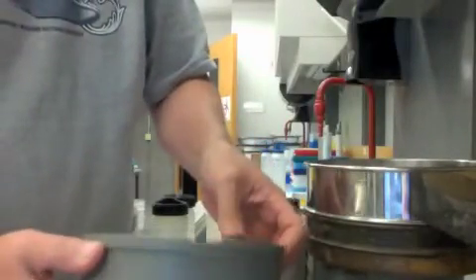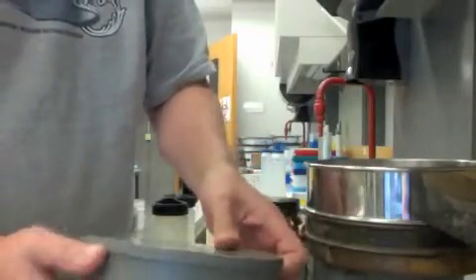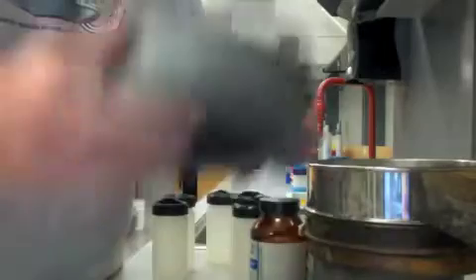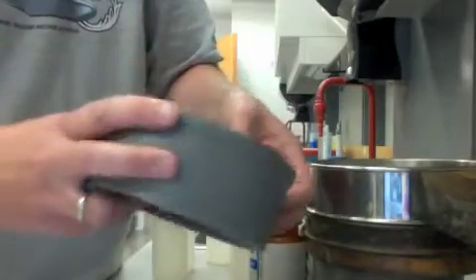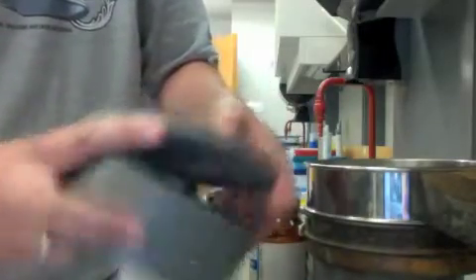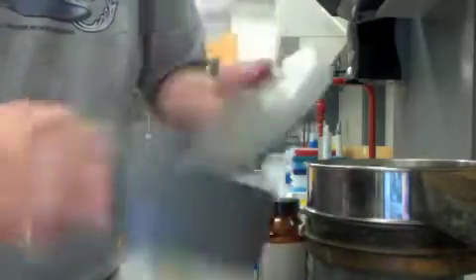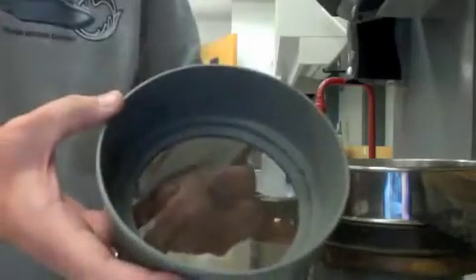The other way is through these. Dr. Whitlow gave these to me, these are actually made for that process. These come apart. They have a top, and there's a sieve in here, and you can't see it too well.